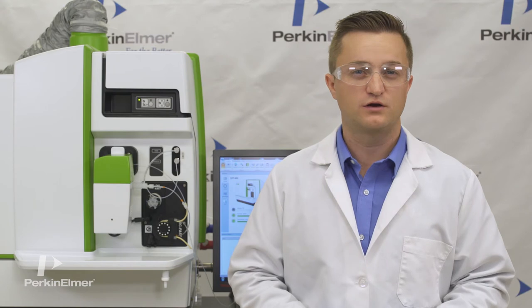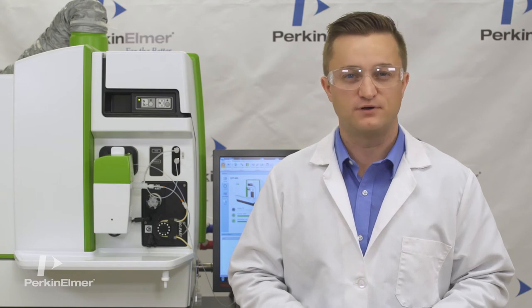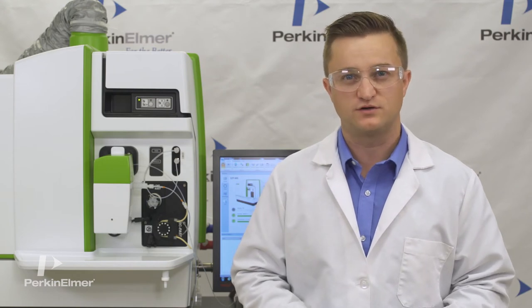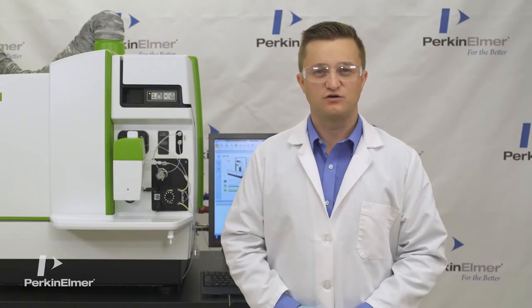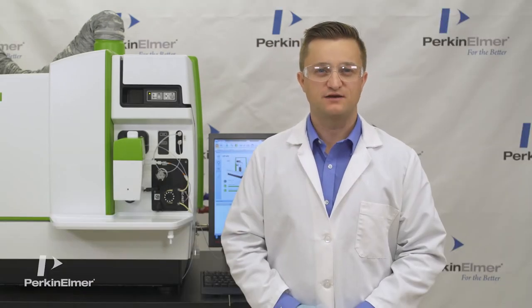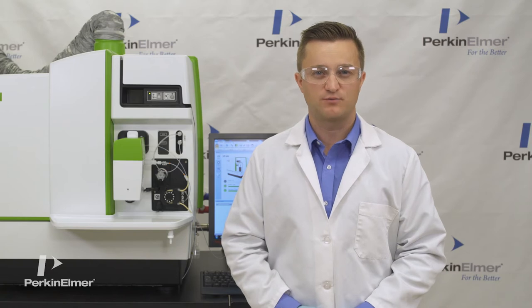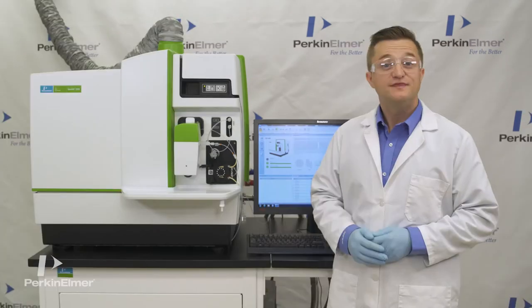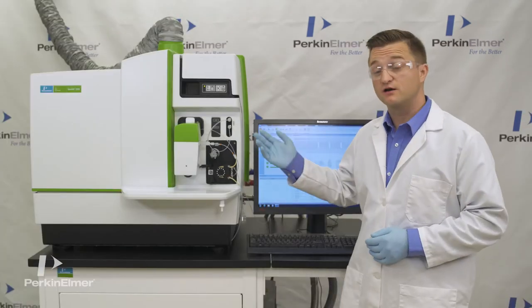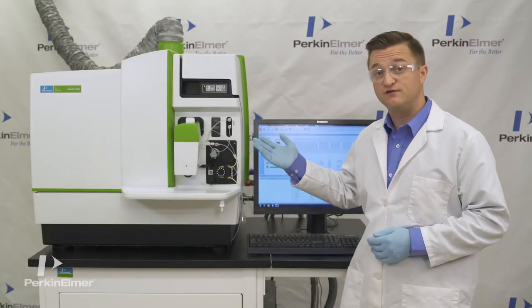To optimize lab productivity, the Nexion 2000 offers our new smart intro color-coded sample introduction modules. Each module has been pre-selected for ideal performance based on lab requirements. The instrument shown here is our productivity version.